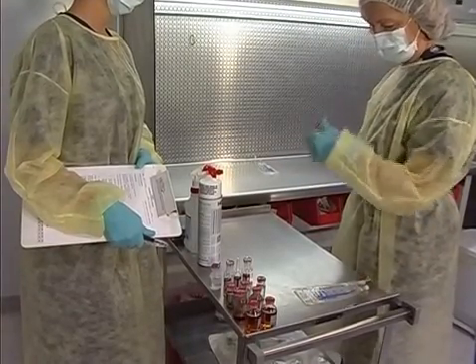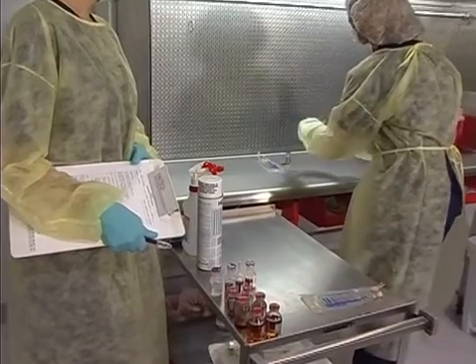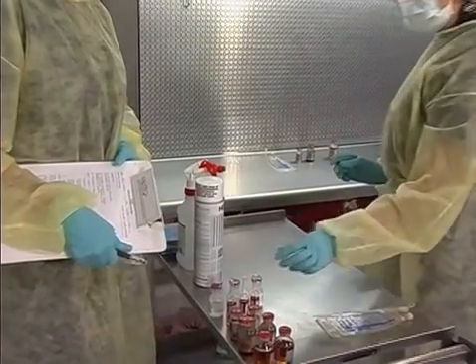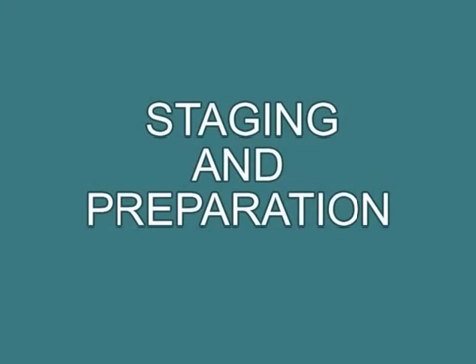Direct the candidate to select the proper compounding tools for the task. Using the normal staging and setup sequence, the candidate should select and place the following materials onto the critical work surface in preparation for the media fill exercise: the Valatec VM20R, a 20-ml vial of dry sterile tryptic soy powder.